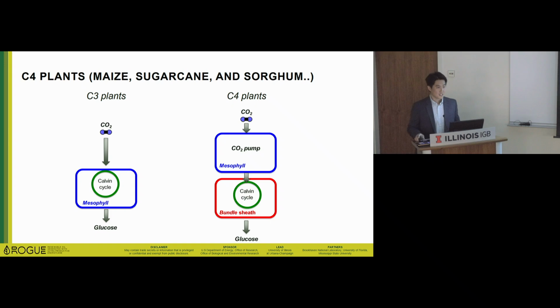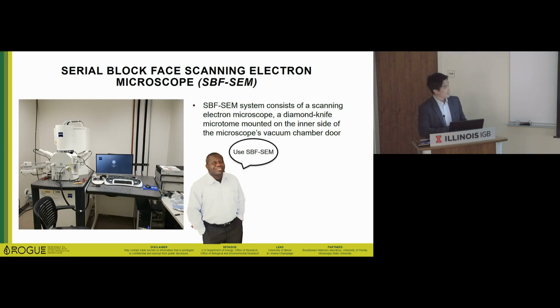So this also made it hard to analyze the chloroplast, because how can I distinguish between the two different cells, and how can I exactly measure this? I spent one year trying to find a better estimation method, and I was very frustrated, almost exhausted. But one day, Kingsley, the senior researcher in our core facility, saved me.